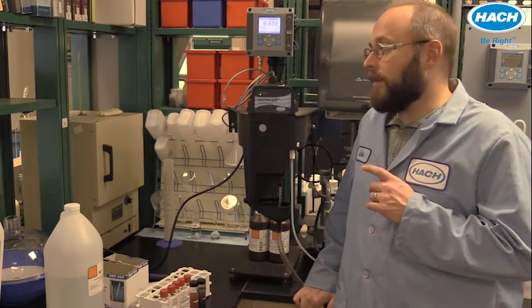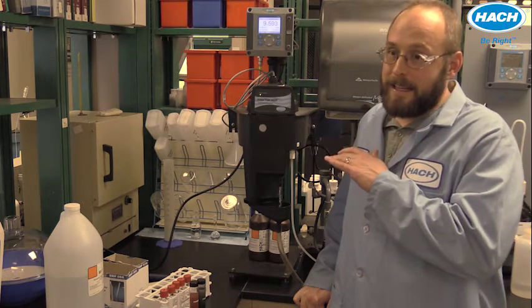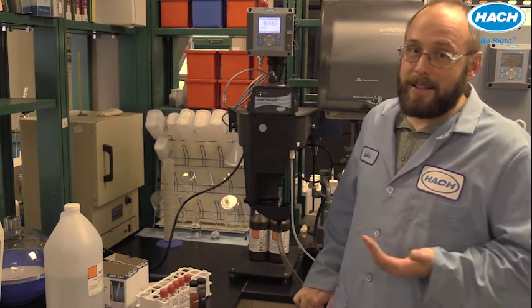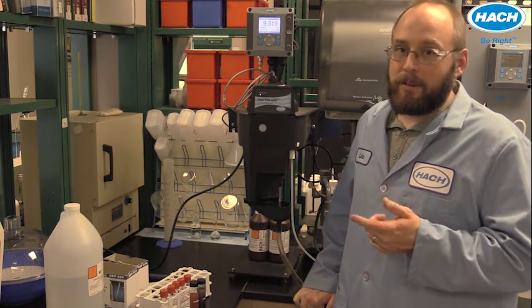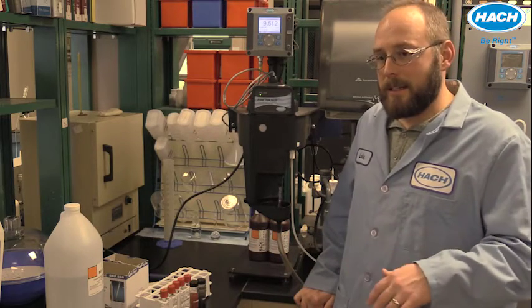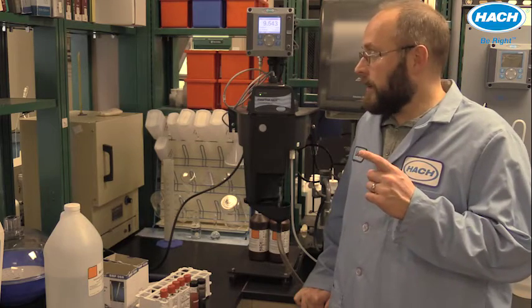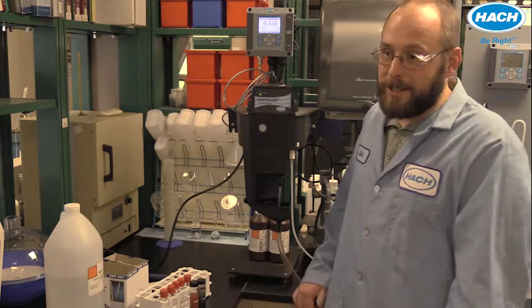So the calibration which we're going to perform assumes that you're running at a steady state and is also not applicable outside of that steady state. Again, we have a paper available on the Hach.com website that describes this application in greater detail and the limitations of this calibration. But feel free to go to the website and download that for more information.